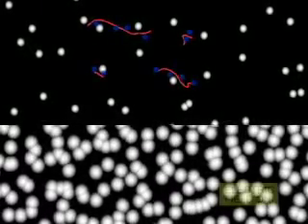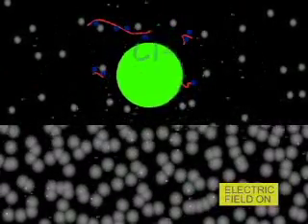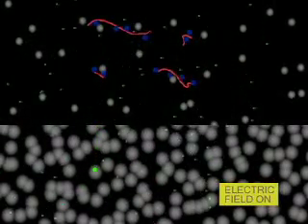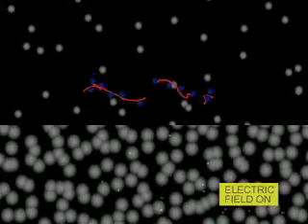To help this process, chloride ions from the buffer separate in the presence of the electric field, creating a cloud around the proteins, in a sense confusing them so that they don't react to the pull of the electric field all of a sudden. Because the chloride ions travel in the direction of the current without any inhibition from the gel matrix, they clear out relatively fast, leaving the proteins to move freely. But the clouds disappear at the starting tip first, allowing the proteins further behind to get a running start. This accounts for stacking.